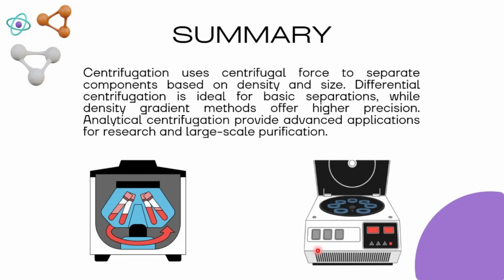In summary, centrifugation uses centrifugal force to separate components based on density and size. Differential centrifugation is ideal for basic separation, while density gradient offers much higher precision. And analytical centrifugation provides advanced applications for research and large scale purification, especially in the enzyme industry.